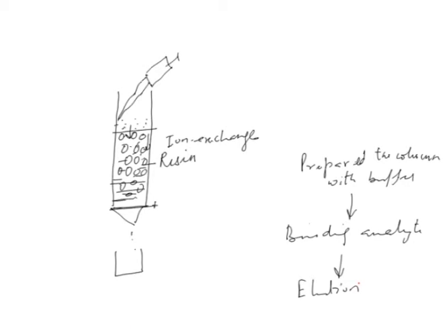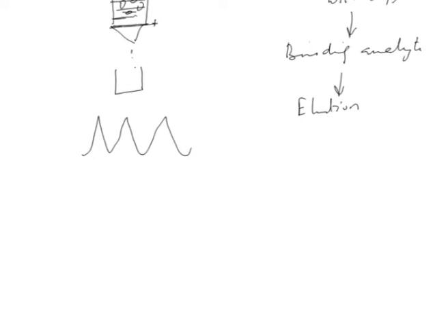What will happen if you have different affinities, as you elute, like say I can use 50 millimolar NaCl, then 100 millimolar, 200 millimolar, and I can go up to 0.5 molar or 1 molar NaCl, and depending on the affinities you will get peaks which will be separated according to the affinities. So, less affinity will come first and higher affinity peak will come later on. Now, once you are done with this, you can regenerate the column as I have explained and again reuse it for another purification step. So, this is how the whole working of the column is done.